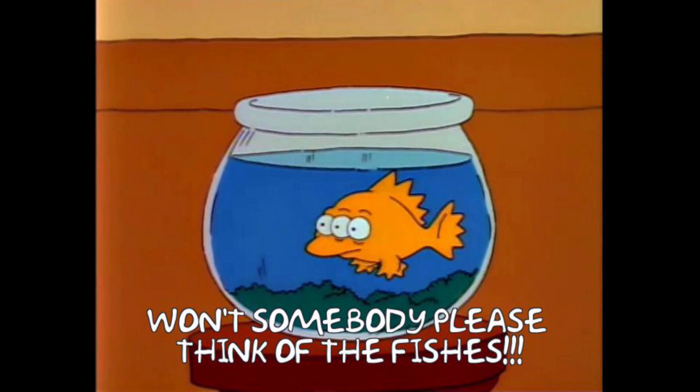Today we're using some really nasty chemicals, and these chemicals could be dangerous to the fish. In particular, arsenic, which is in the arsenomolybdate solution, and copper are very, very toxic to aquatic life. So please think about the fish, and as Claire has suggested, don't put your reagents down the sink.